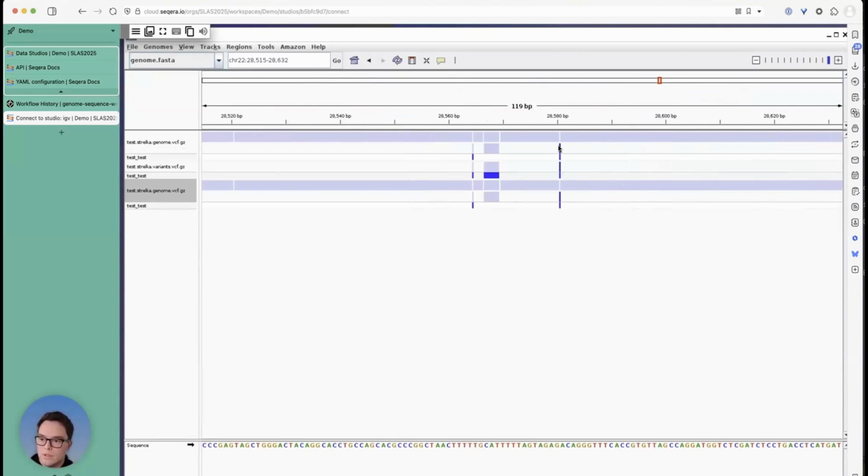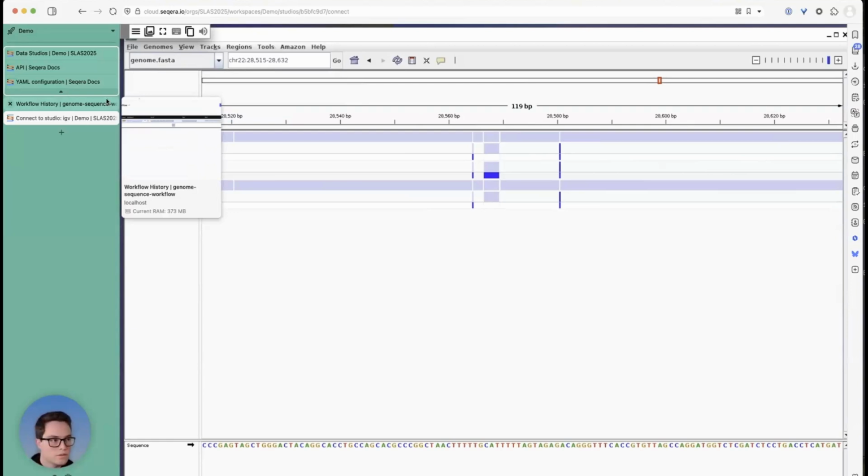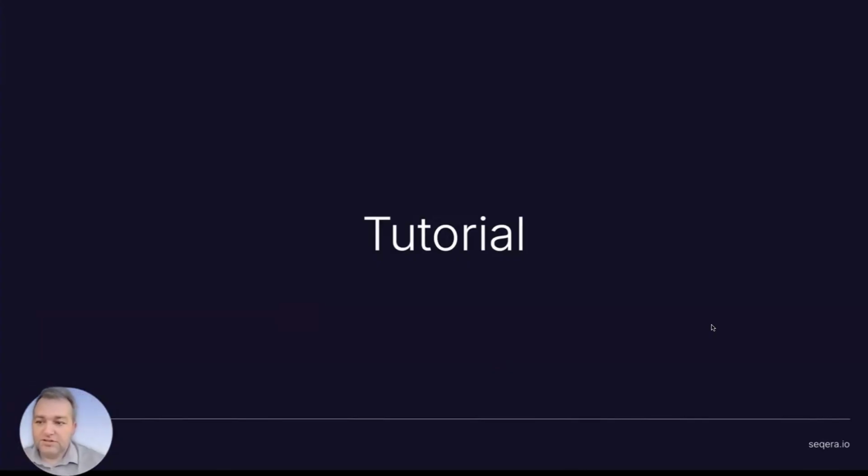So that was Data Studios. I think that covers all of the pieces of Seqera Platform and launching the automation with that. So thank you all. Thank you for that demo, Edmund.